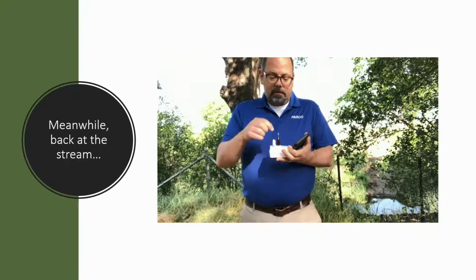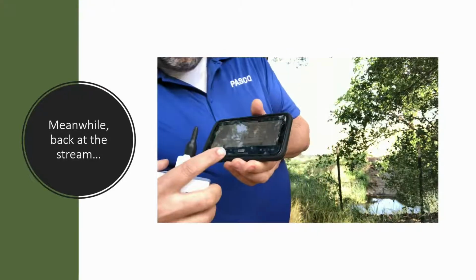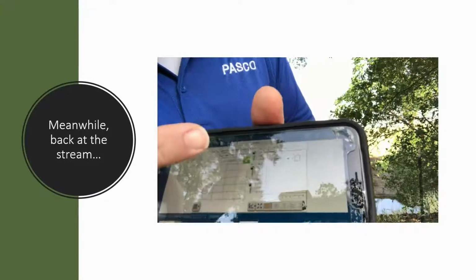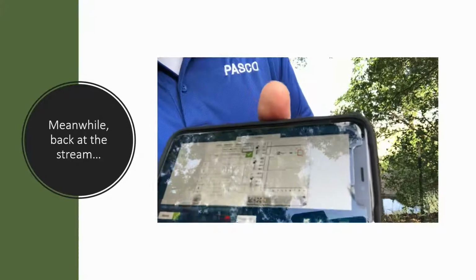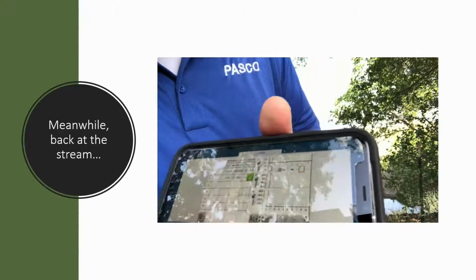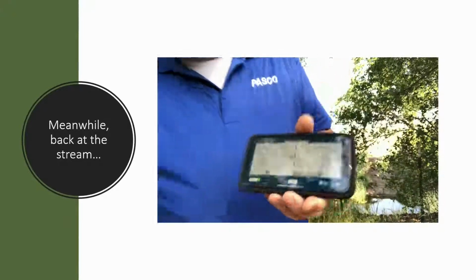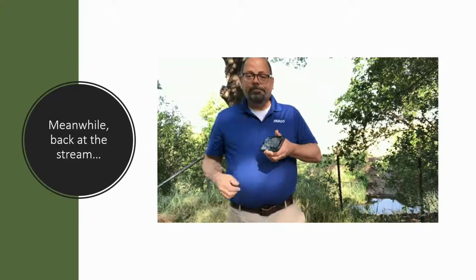You'll put it inside of this unit, and when you're ready you'll start, and you'll see there's a little green check mark that all you do is when you're ready and you get to your new site, you're just going to say, oh, I want to collect that site based on what's being absorbed here. We can hit that. The other place you can hit it is right down here at the bottom, and that'll save a spot, and then you bring your data back. You can share it right to your computer through the share function.